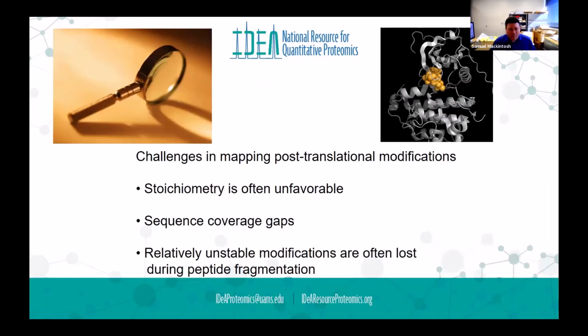So then we'll wrap up with just a little bit about applying this to identification of PTMs. And this works essentially the same way. So you can probably see that as long as you know the mass of the PTM and where you expect it to be, say we're talking about phosphorylation here, we know if there's a phosphorylation present, it's going to be on serine, threonine, or tyrosine, and we know what the mass change is going to be.